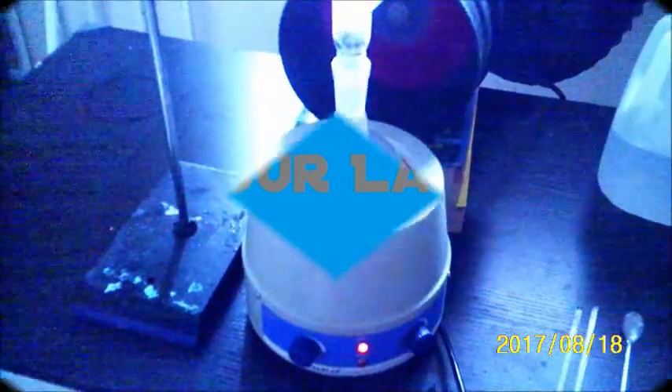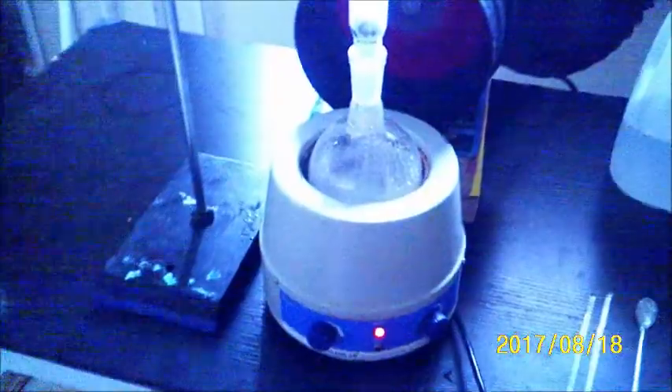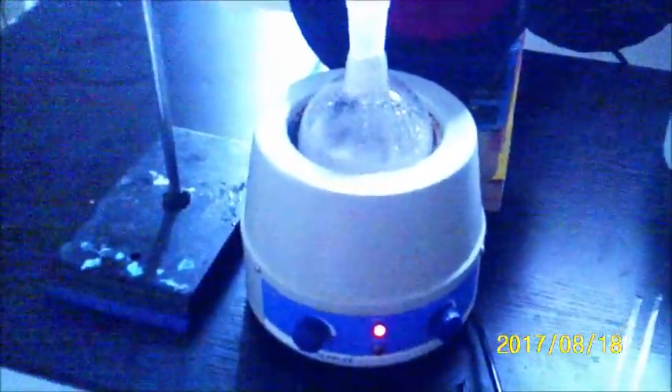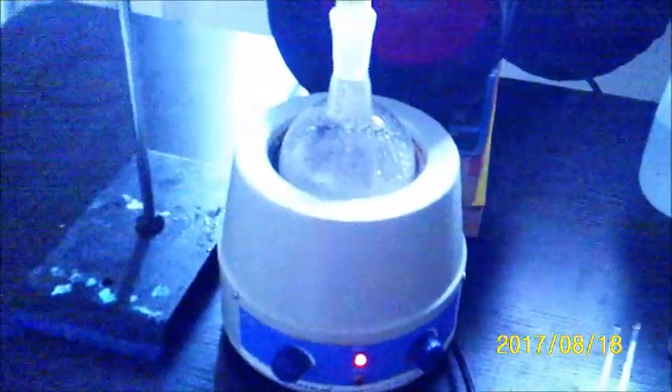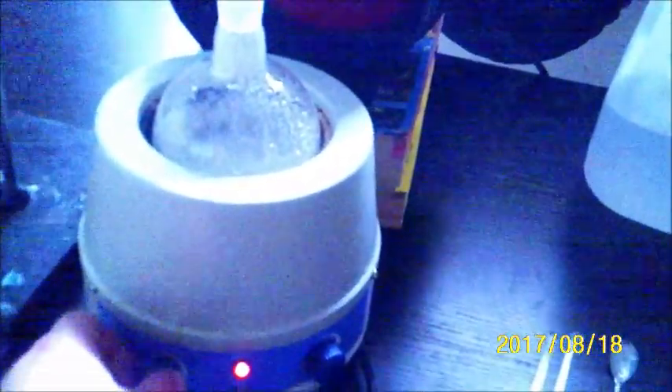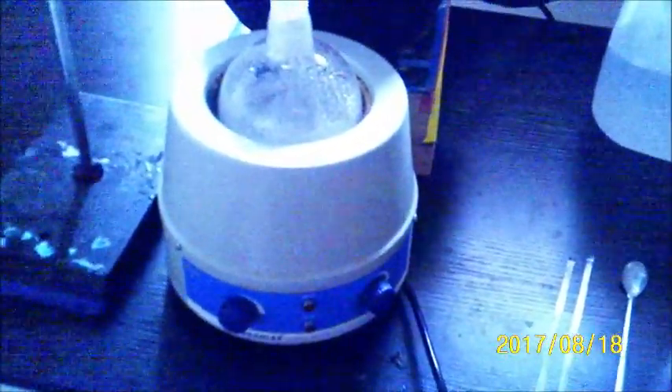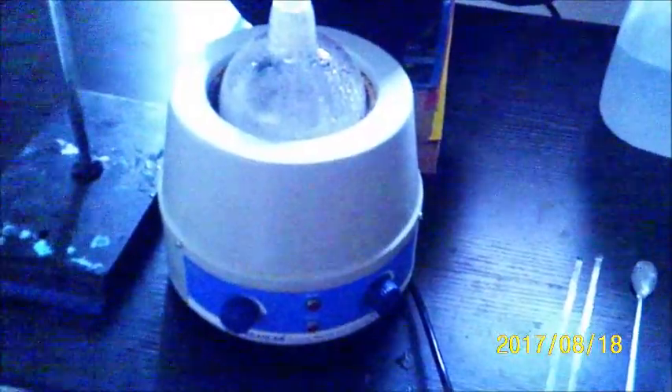It's been an hour of boiling the solution. Now we're ready to turn off the heat and allow this to cool to room temperature. We'll be able to assess the results of the experiment after it cools. We're going to shut off the heat and I will allow this to cool. I will be back with another video discussing the results of the spectral analysis.